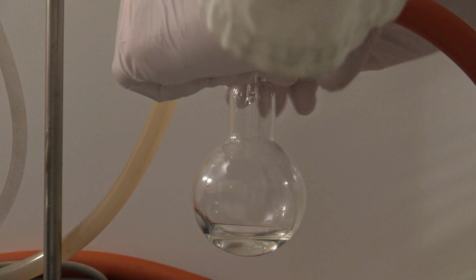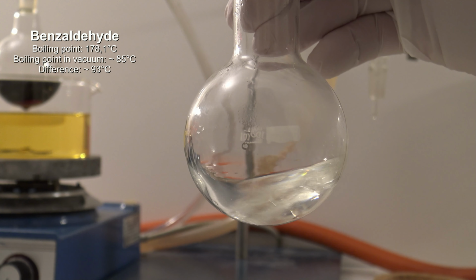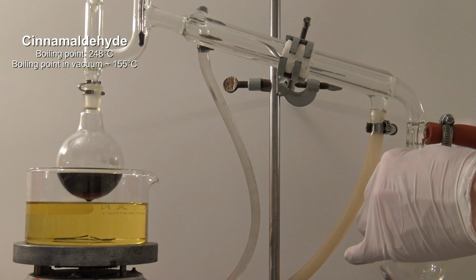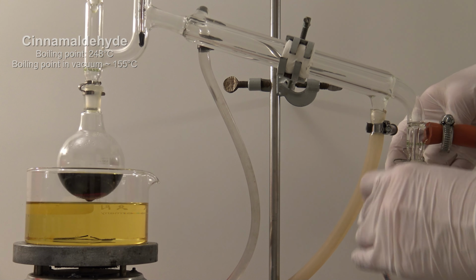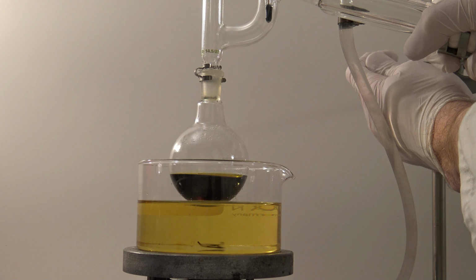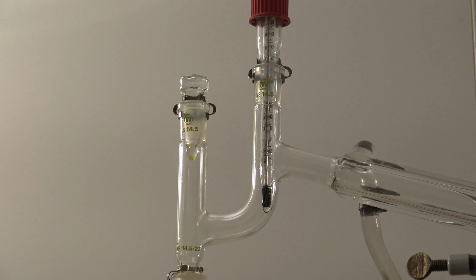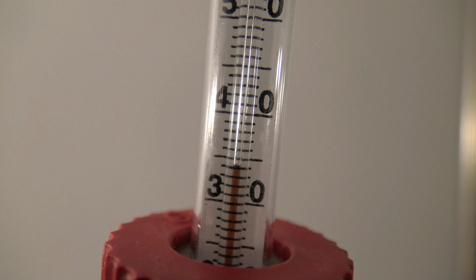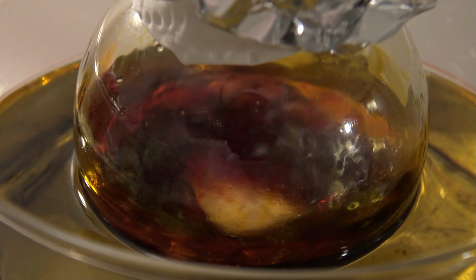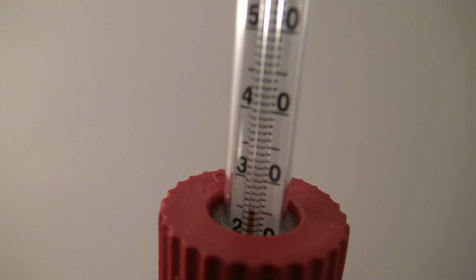The receiving flask was swapped and it was noticed that the condensate had the distinct smell of benzaldehyde. This meant that the boiling point was decreased by around 90 degrees C due to the vacuum. So this had to apply to the boiling point of the cinnamaldehyde too, even though this was only a rough estimation. Then the yellow oil was collected, which had a boiling point of 134 degrees C. The distillation was slow, so the apparatus was isolated. When the temperature dropped, the distillation was stopped.